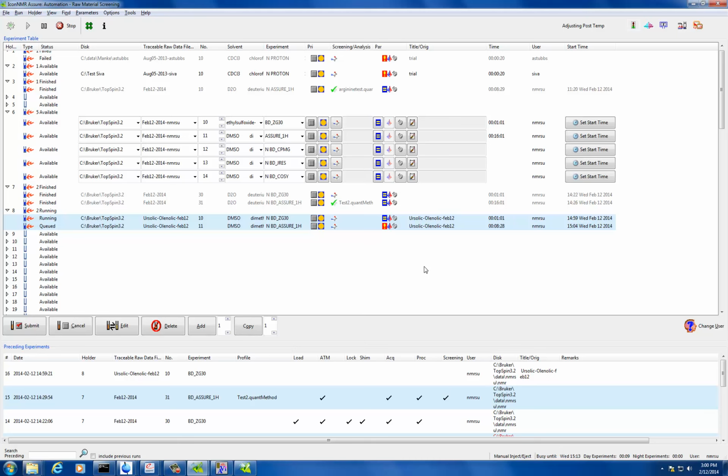Oh, we could even use something as simple as ethylbenzene for a reference standard. Exactly. Anything that you can. They're not extremely expensive. You can put DSS in as your internal reference standard. It's one of your internal standards, right? Yeah, DSS.